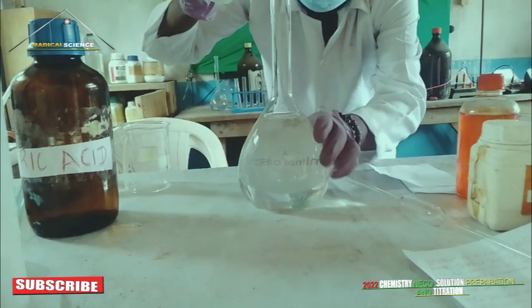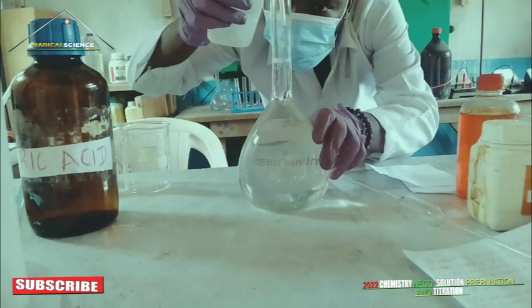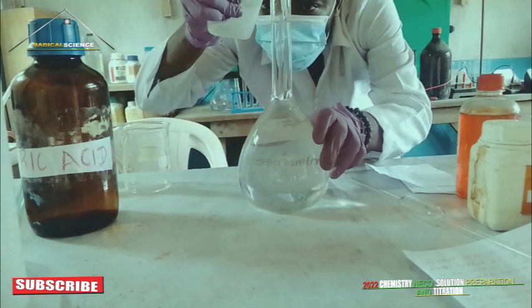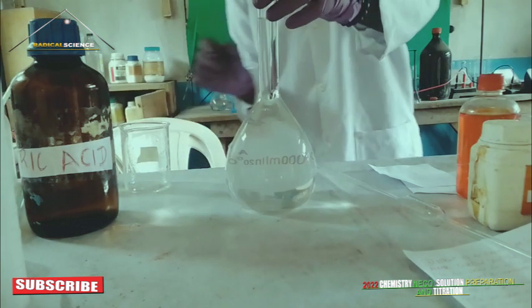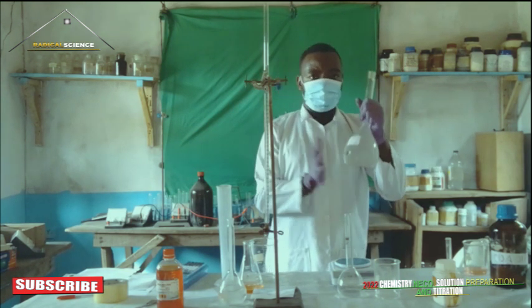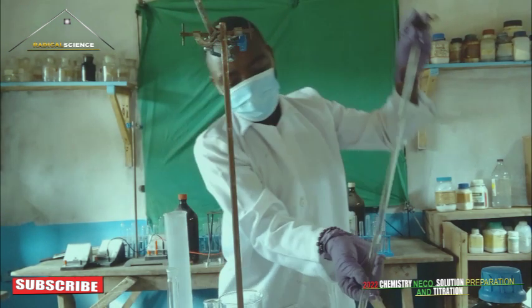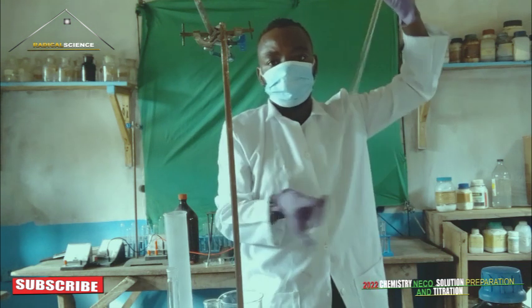Make sure it doesn't exceed this line. Okay, so we have our BN ready now.